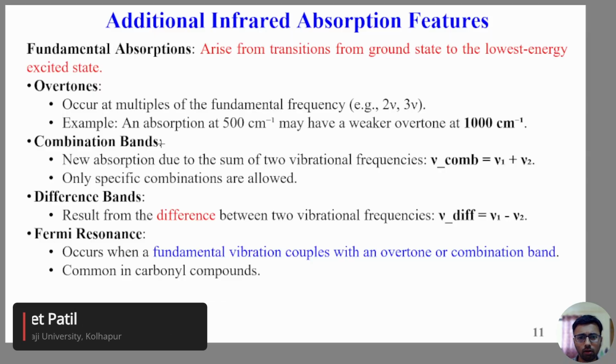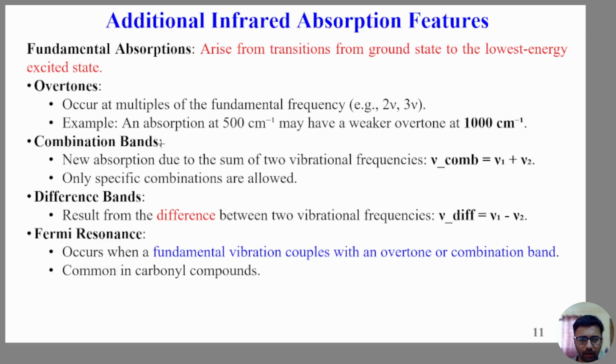A good analogy is a guitar string. When you pluck a guitar string, you hear the main tone, the fundamental frequency. But you also hear weaker harmonic tones. These are similar to overtones.